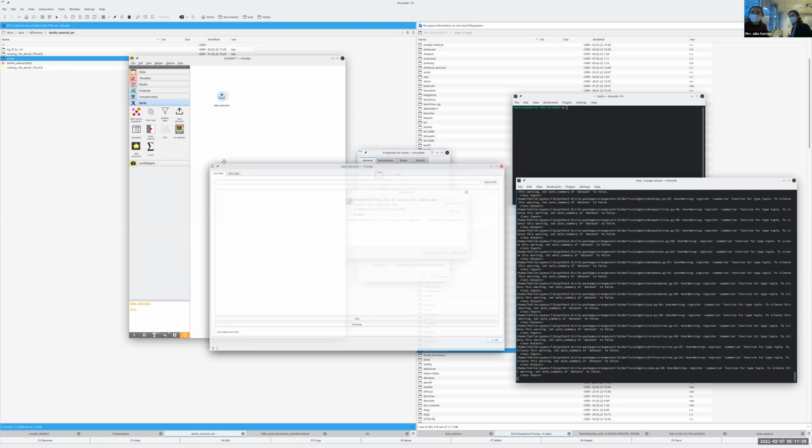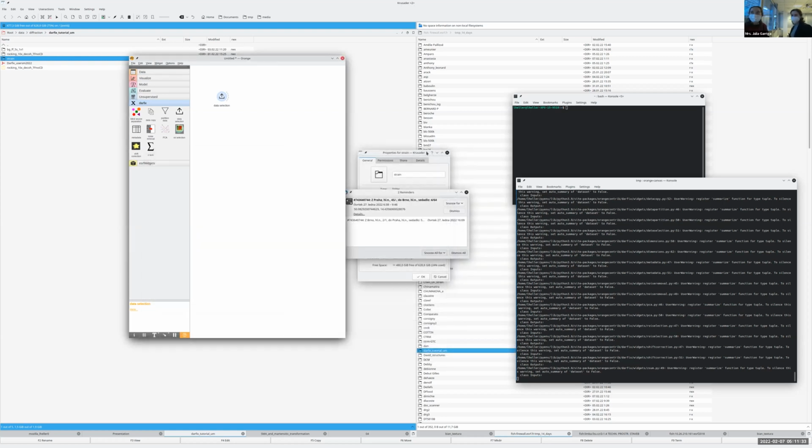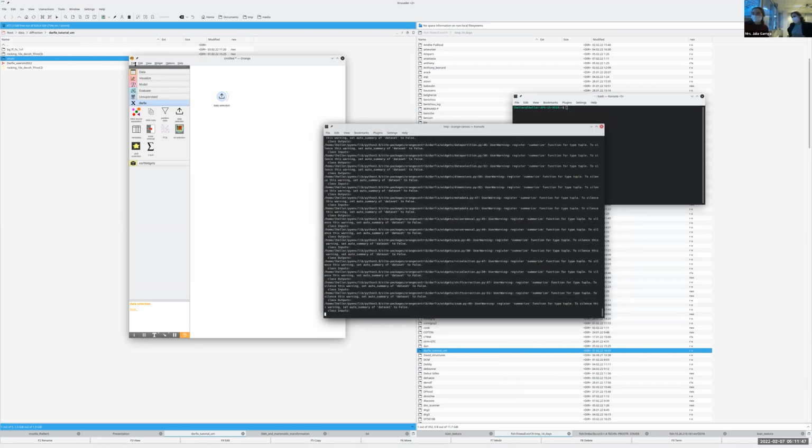What was that command that popped up a window, something with changes? If I want to restore the last crashed session? No. Okay, that's weird now. Could you go back to the, okay, close, you could close the range.